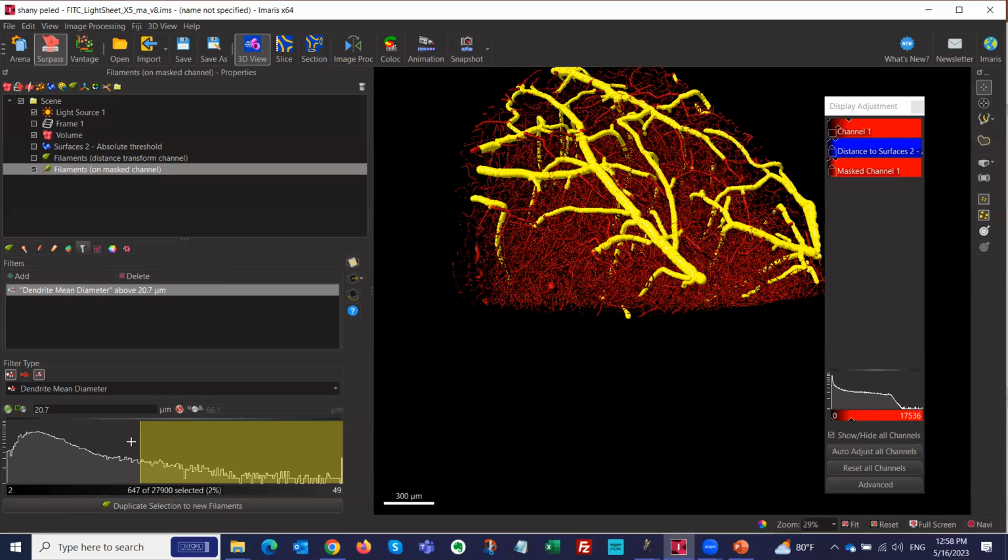I mean, you can use one and then use all the samples. I don't recommend just doing it on one and saying, hooray, it will work on 100. Just test it with at least 3, 4, 5. The more, the better, just to make it robust. And if it works on all of those, then just do it on 100 images, don't worry about it.